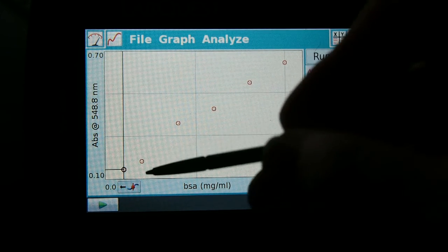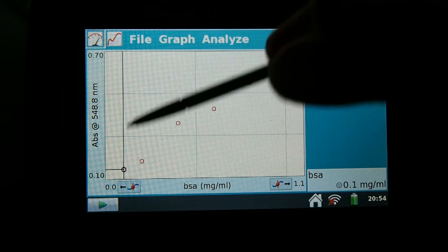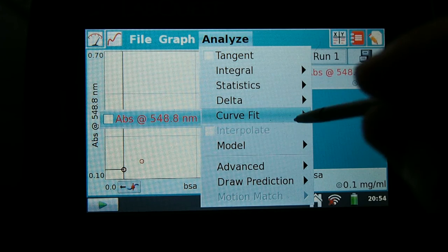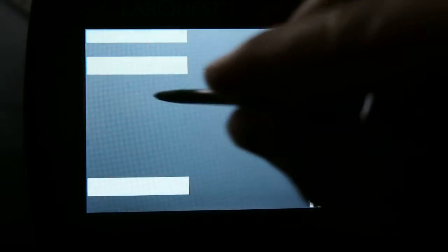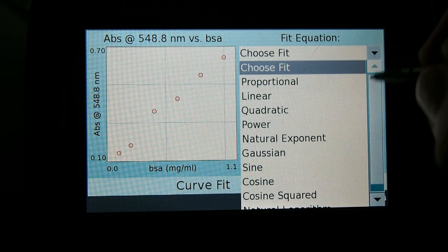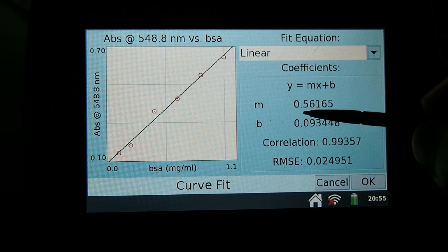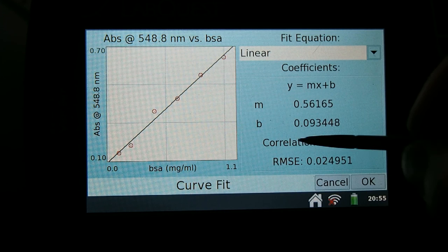And we can see and visualize that there's roughly a straight line. Pressing graph, we can actually look at different things — we can even analyze them and do a curve fit. Remember, Y equals MX plus B is a linear curve. So we're going to do a curve fit using that data, and we're going to choose the linear fit. It shows us what the slope M and B, the y-intercept, are, as well as the correlation, which shows that there is a good fitted line at about 99%. And we can see that there's just one aberrant point that does not lie very well on the line.